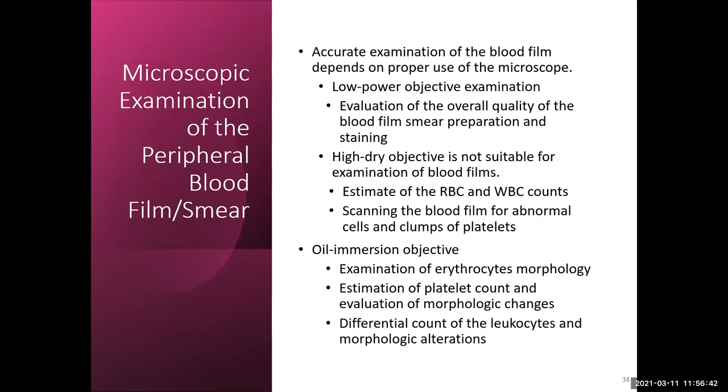And then oil immersion. And remember, when you get in lab and you're looking at these slides, once you put the oil on, you cannot go back to your high dry, your 40X. So once you move to that white lens, do not circle back to that blue lens.